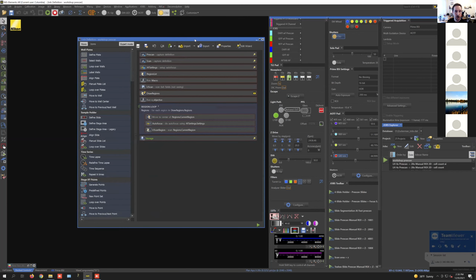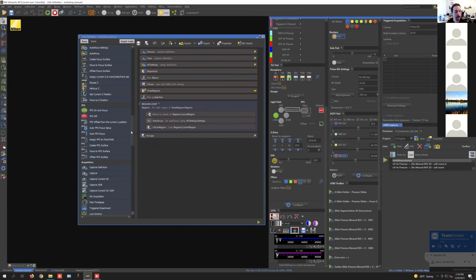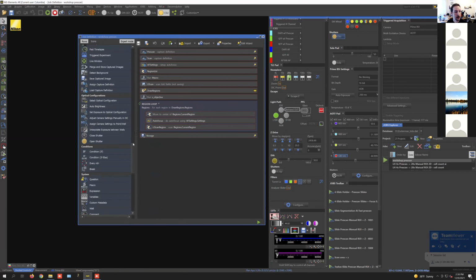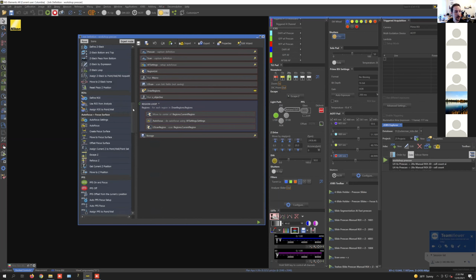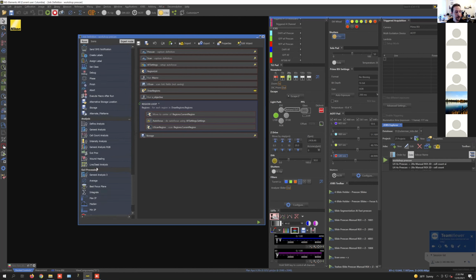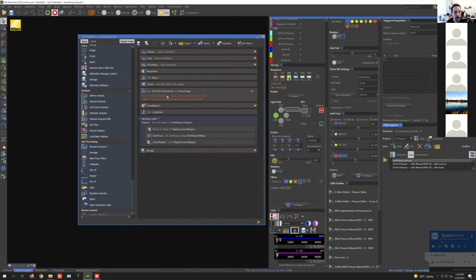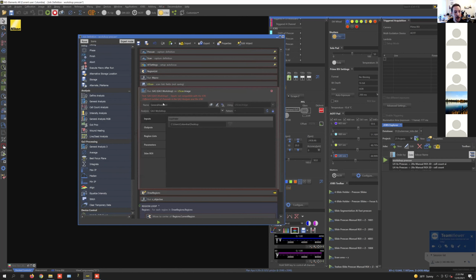if you were going to do automation in either of these things, detecting the tissue or detecting the cells, then we would put a general analysis step in. This is towards the bottom here. And we're actually using General Analysis 3, which is a slightly newer version of their analysis processing tools. And instead of drawing regions, we would put it here. And then we would have to make a job.